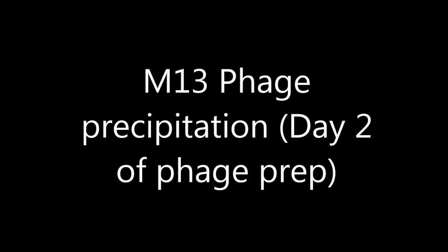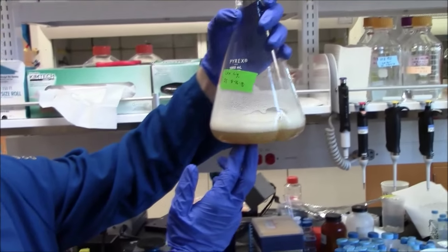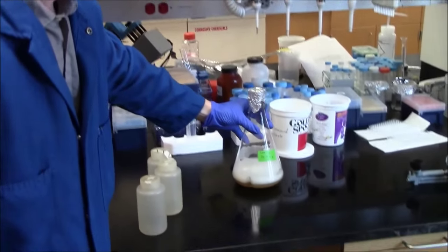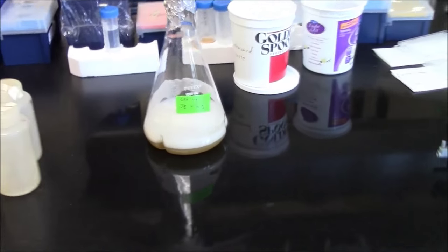This video shows the harvesting of M13 phage. This is just a 1 liter. Day two starts with an overnight culture. It should be very turbid, with lots of cloudiness from the myriad of bacteria that have grown overnight.